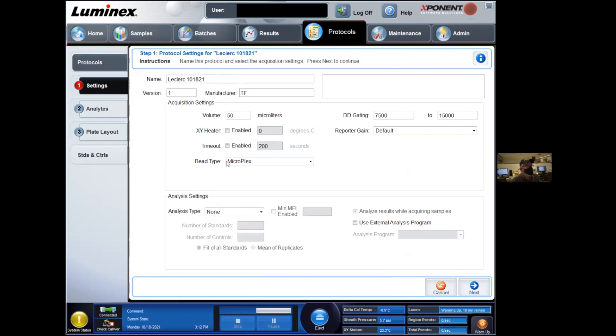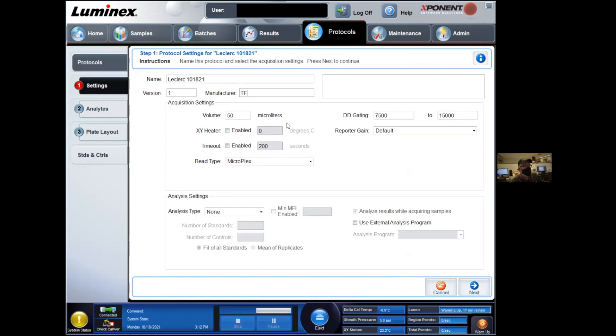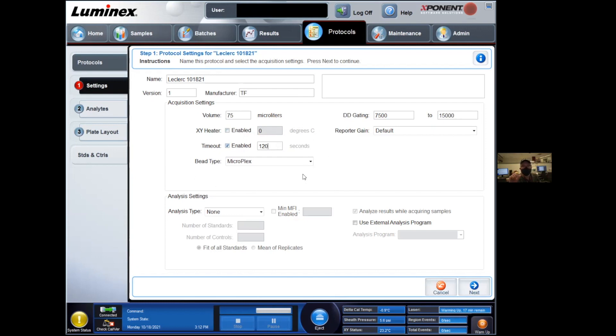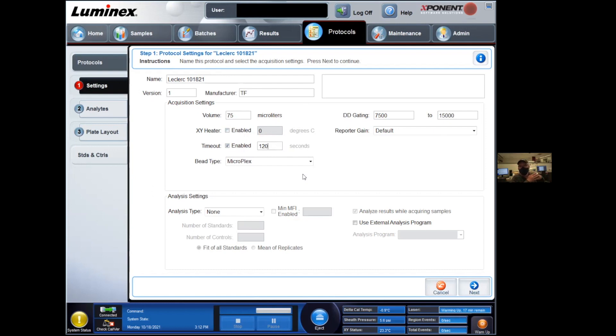Under acquisition settings, you have a series of information that you want to enter regarding the way the instrument will run the plates. This information is available in the booklet if you're not quite sure what to enter. I'd recommend 75 microliters, a timeout of 120 seconds, about two minutes per well. If the bead count does not reach its limit before that timeout threshold, then it's going to stop the acquisition. So that prevents the instrument from getting stuck on a plate where very few beads are present.